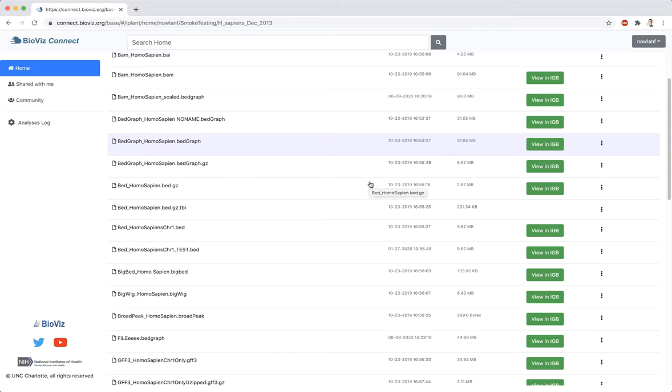Files stored in BioVizConnect can be viewed in IGB. Compatible file types will have a green View in IGB button present in BioVizConnect.